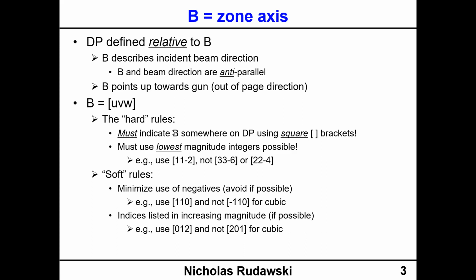So even though the pattern has a certain symmetry, that is not always representative of the true crystal symmetry. All right, so since we're assuming that we have a cubic crystal and we have 4 mm point symmetry, the indexing to do this is actually not terribly difficult.